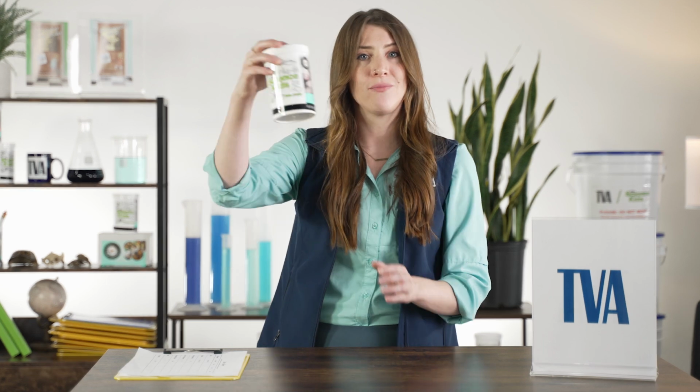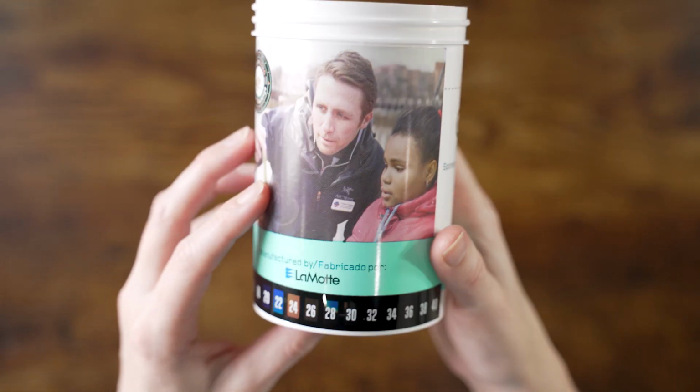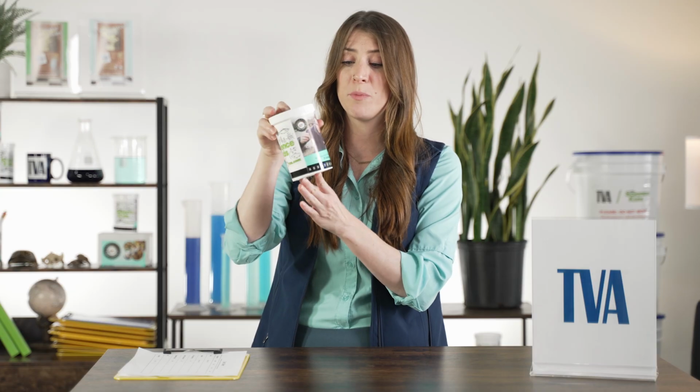This is your beaker. Sometimes it's made out of glass, but the shape of this science equipment is what makes it called a beaker. On the outside of your beaker, there is a black strip with numbers on it. This is your thermometer, and it's what we will use to test our water temperature. If you take your finger and put it on one of the colored numbers and rub it, you should see it change color because it's reacting to your body heat.